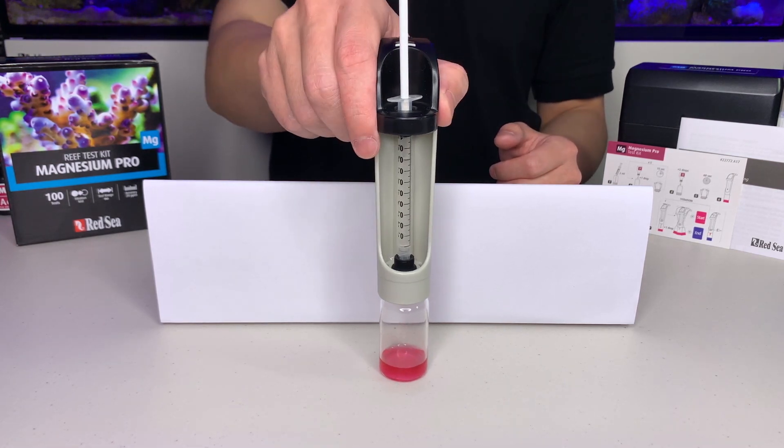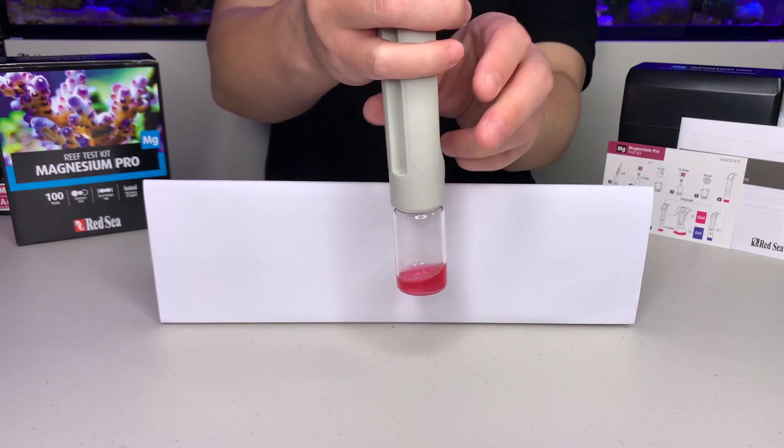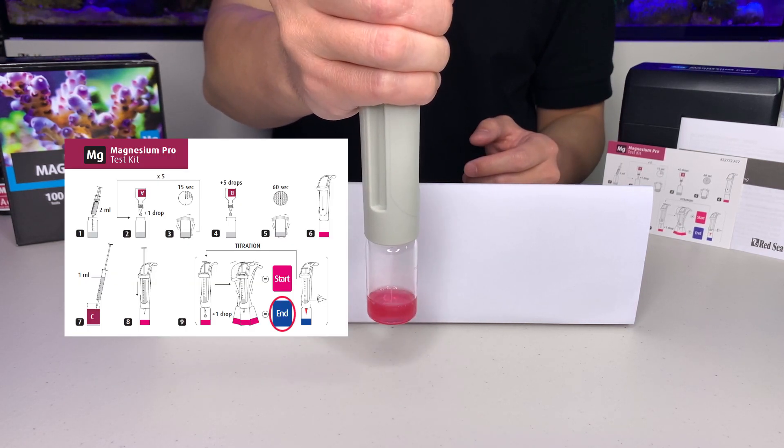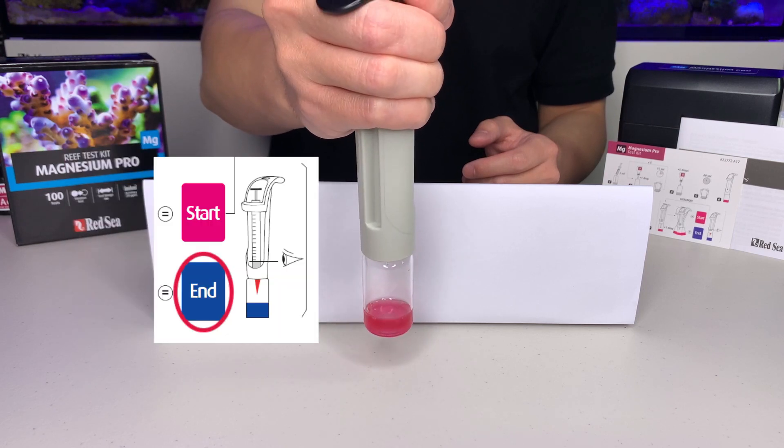Now we start doing the titration by slowly adding the titrant into the vial and shaking it at the same time. We are looking for the color change from pink to blue.